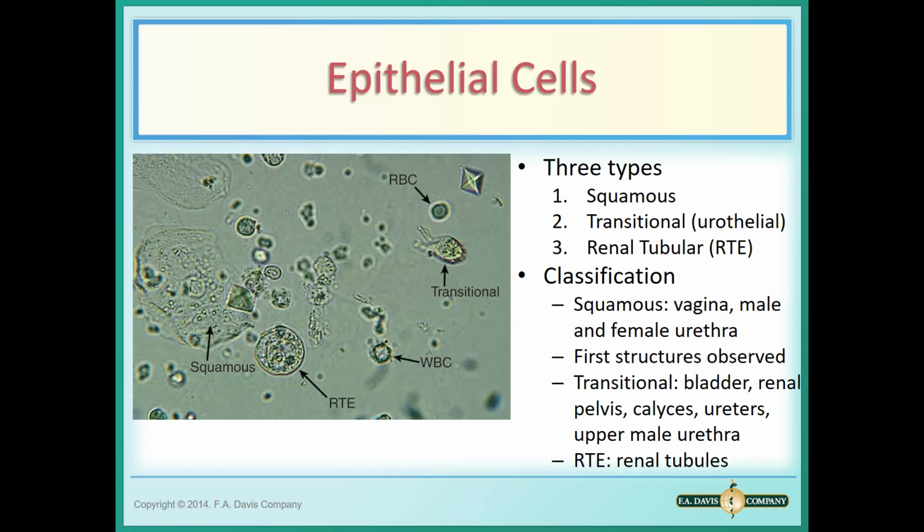They're shed normally just during voiding of urine, and you typically are going to see some in virtually every random or clean catch urine. So we're not going to panic about those, but the good news is, because there are usually a few there, it's something great to find and focus on when we're trying to make sure we're in the right plane of the urine for microscopic evaluation.